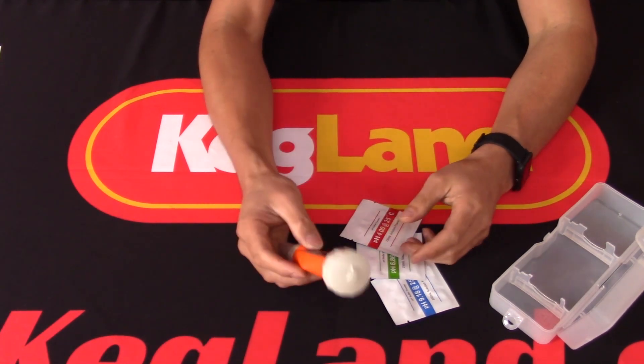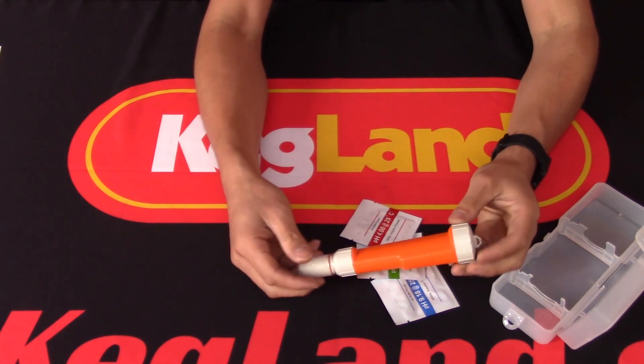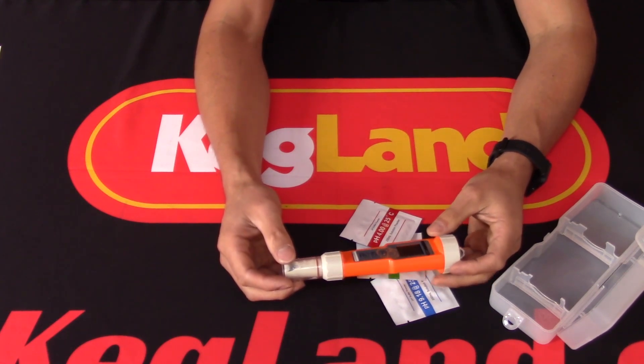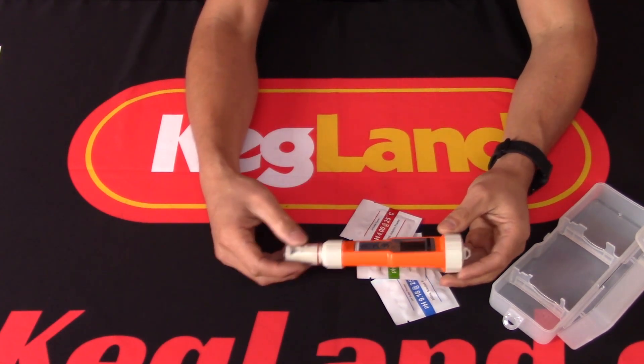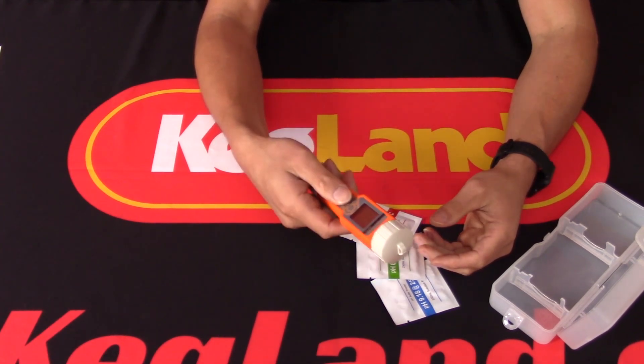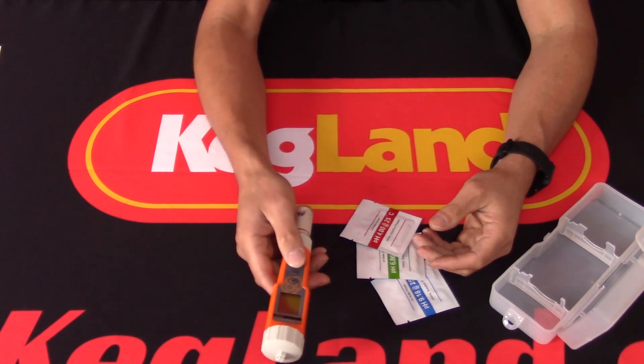We also wanted to make sure we had a pH meter with reasonable resolution — this goes to 0.01 pH, so it's fairly accurate. We also wanted the screen to automatically turn off after a certain period of inactivity so you don't burn up all your batteries.